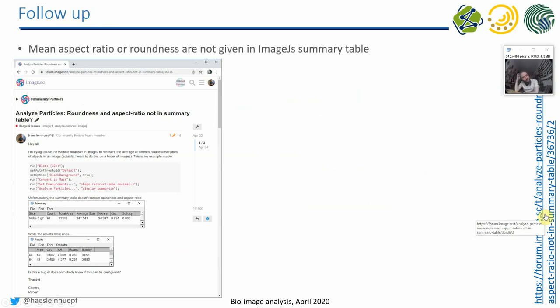Furthermore, during the exercise last week, some of you were struggling with the fact that when you call the particle analyzer and ask it to summarize your measurements, the roundness and the aspect ratio are not summarized. So there is no mean aspect ratio or mean roundness in the results in the summary table.